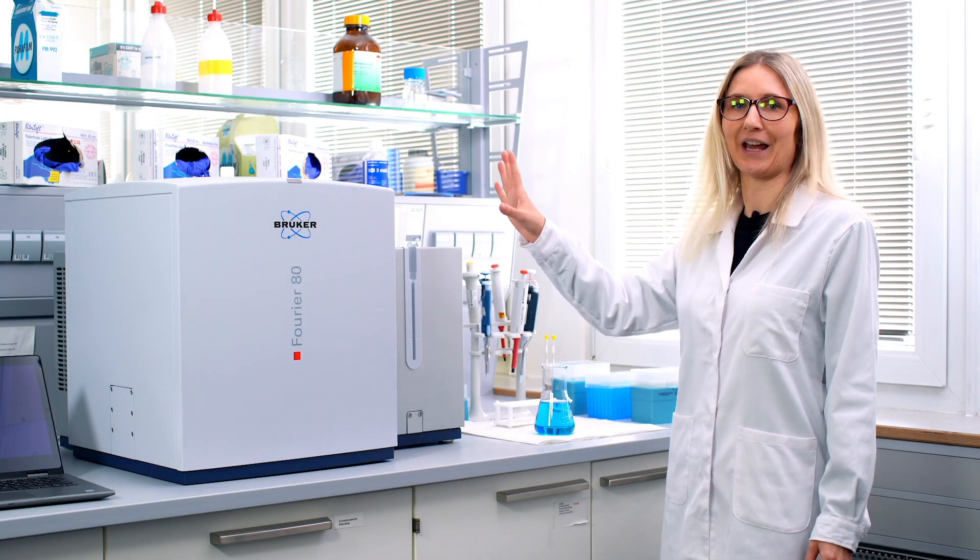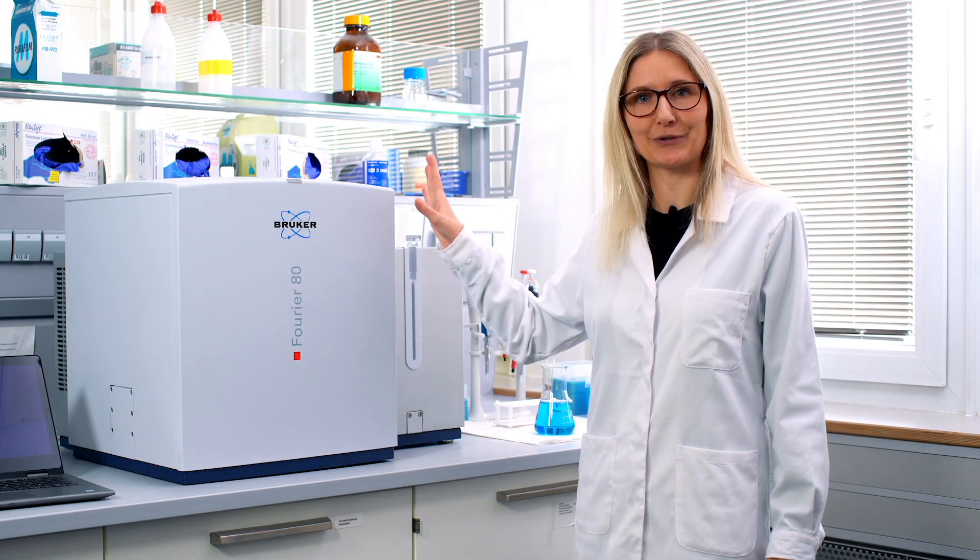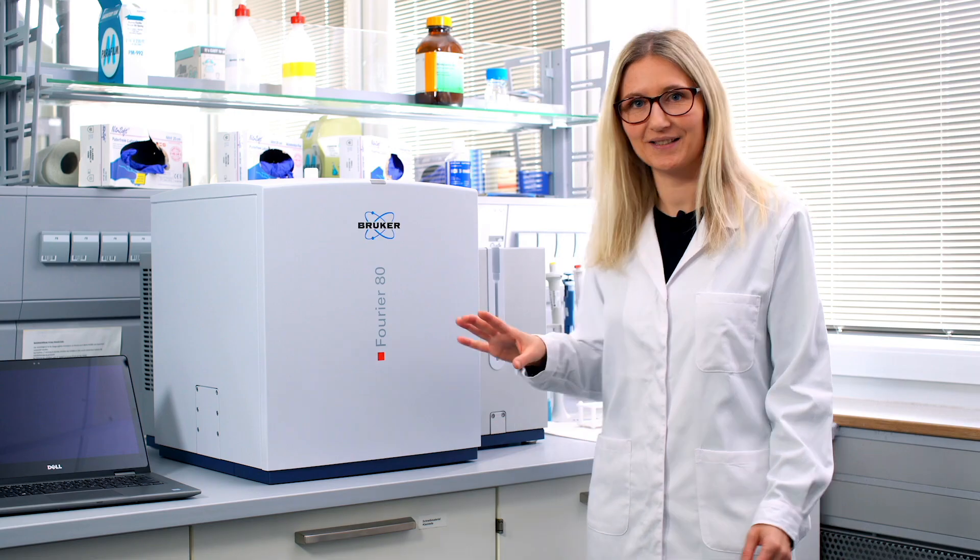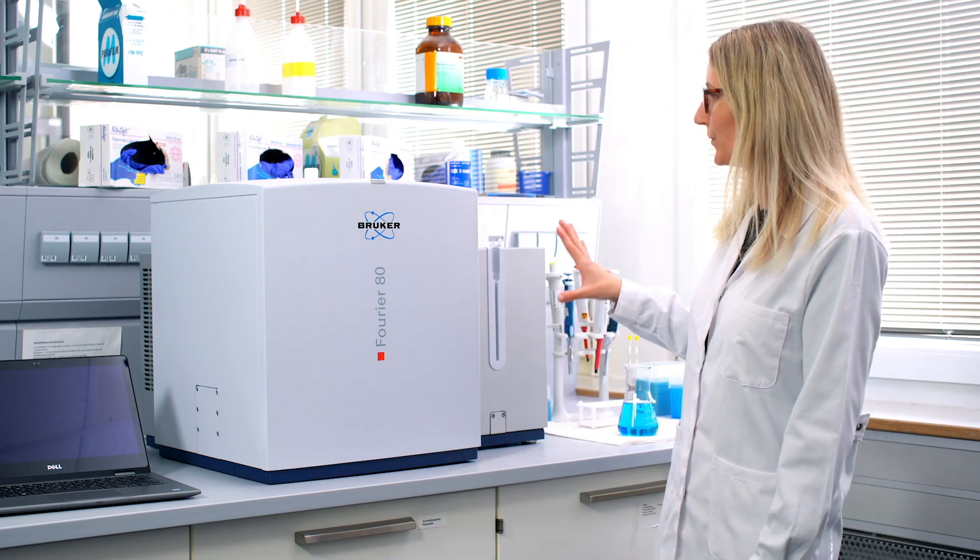However, the good news is the Fourier 80 Benchtop system is doing the job for you. As one can nicely see, the system comes as one unit. However, it has two housings.